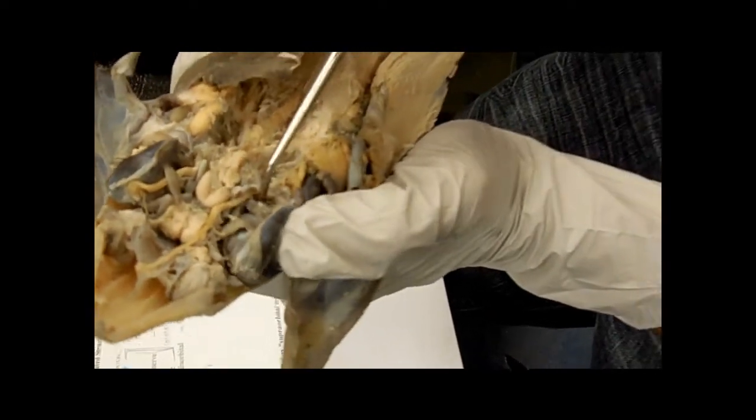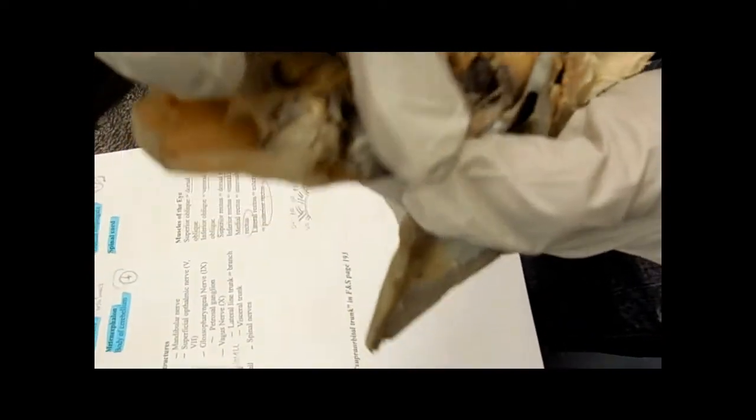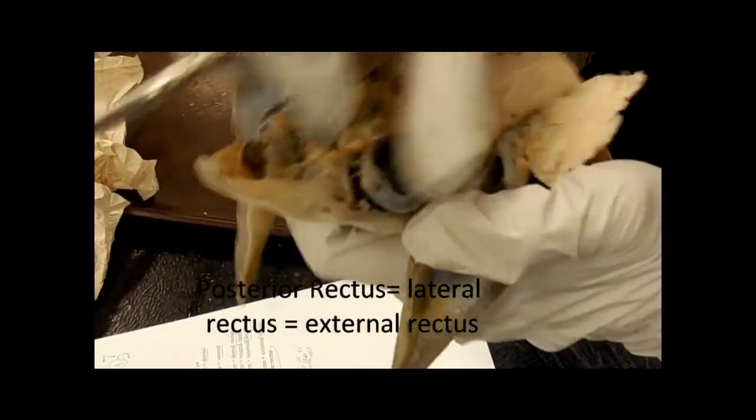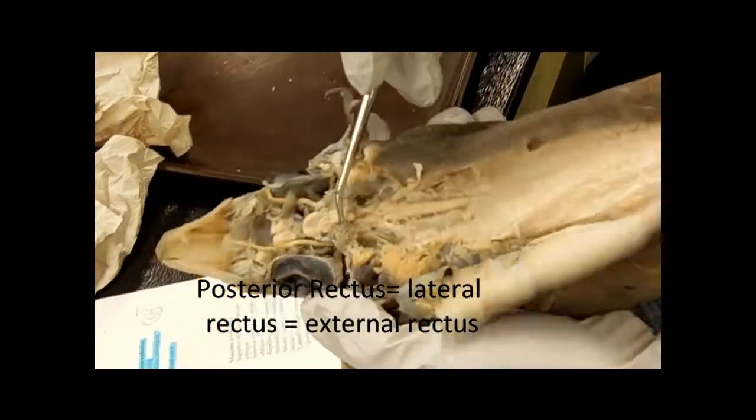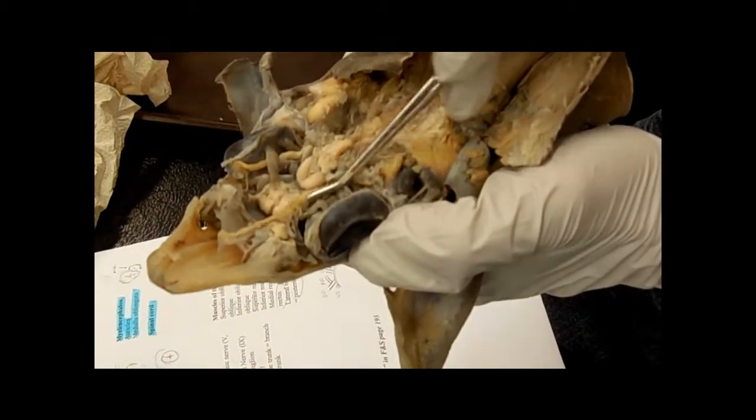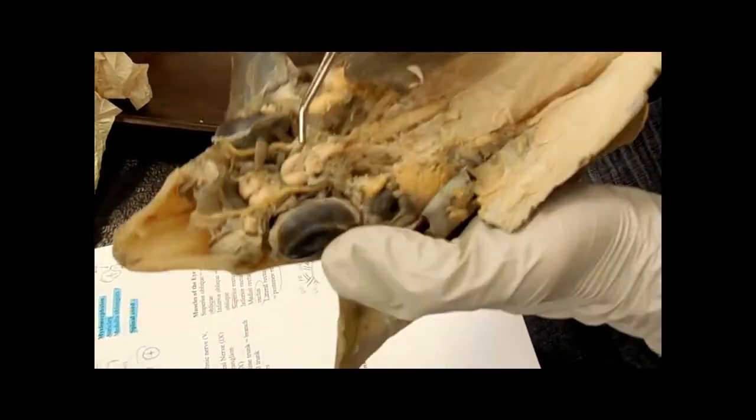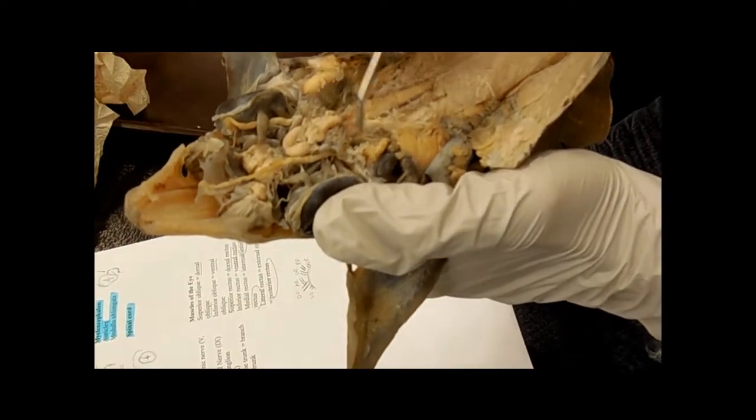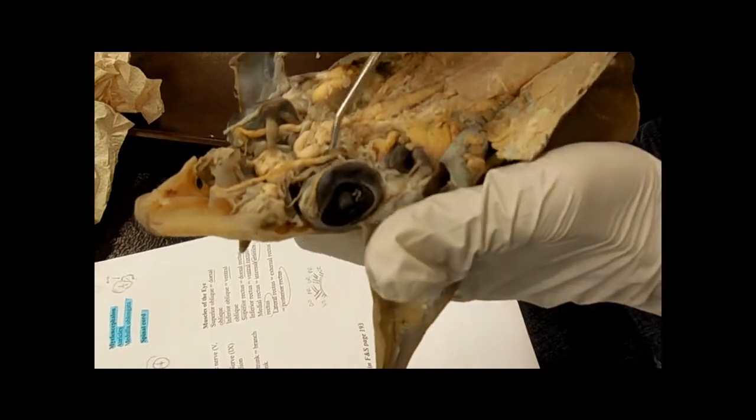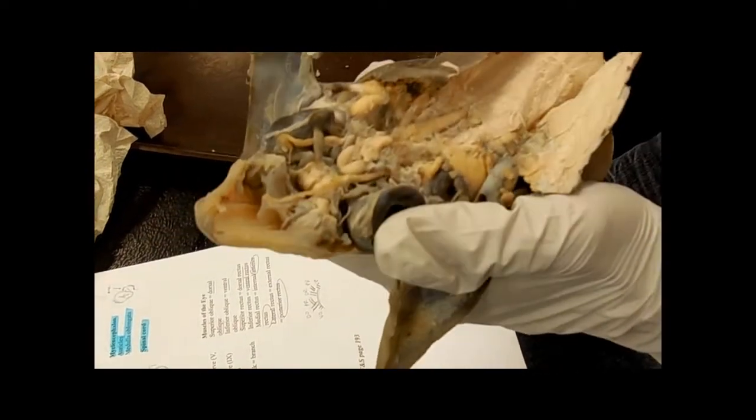Anterior rectus, and then this one's the posterior rectus. So dorsal stuff, ventral stuff, anterior, posterior. So the front ones are the obliques, the back ones are the rectus.